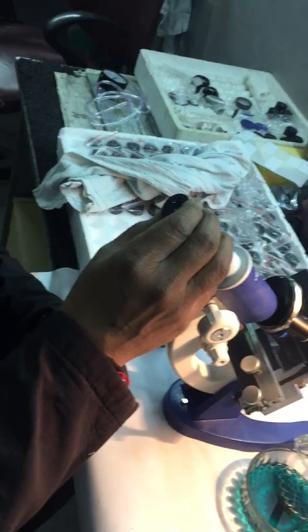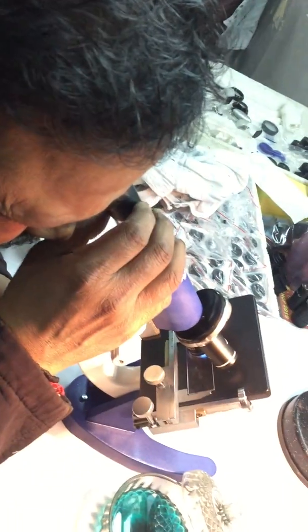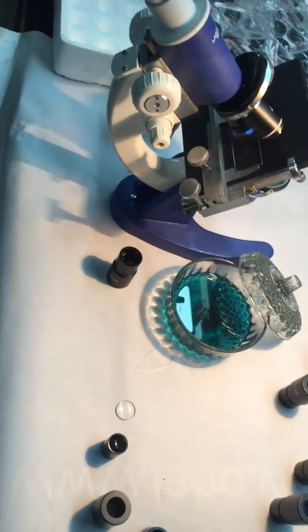So we will put it on the microscope and then we will check. This is the cleaning process of the eyepiece. Thank you so much.